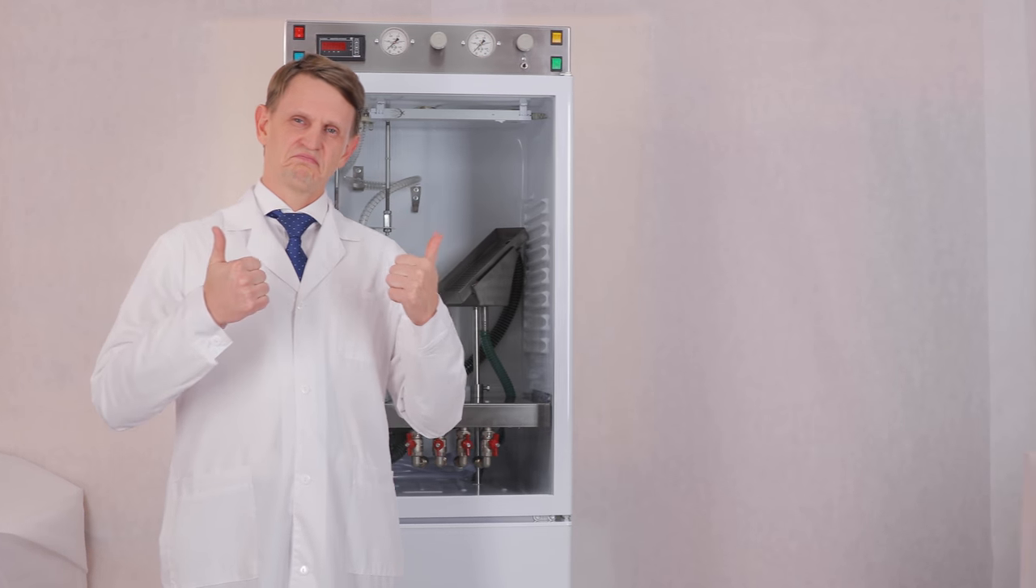We send the equipment and delegate our specialists to customers all over the world.